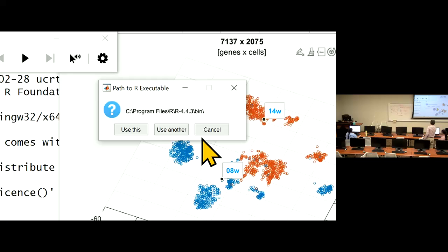So click this. Yeah, that has already been set. Actually, good. Yeah, but I don't know how. Input data and example. Okay, then process. Yeah, you're ready. And then you click this label, the batch. Yeah. So now you can click external, then find Harmony somewhere. I don't know.